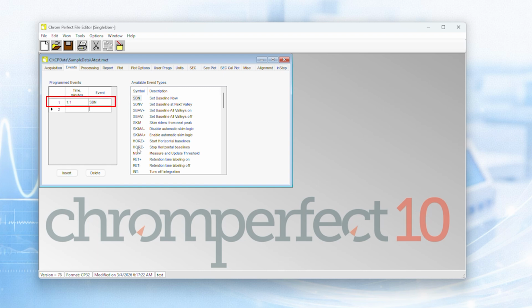Some events act at a single moment, such as forcing a baseline action at a specific time. Others operate over a defined time window, such as modifying baseline behavior between two time points. Changing events can change calculated peak areas and therefore change reported results. However, they do not require the sample to be rerun. The raw data remains intact.